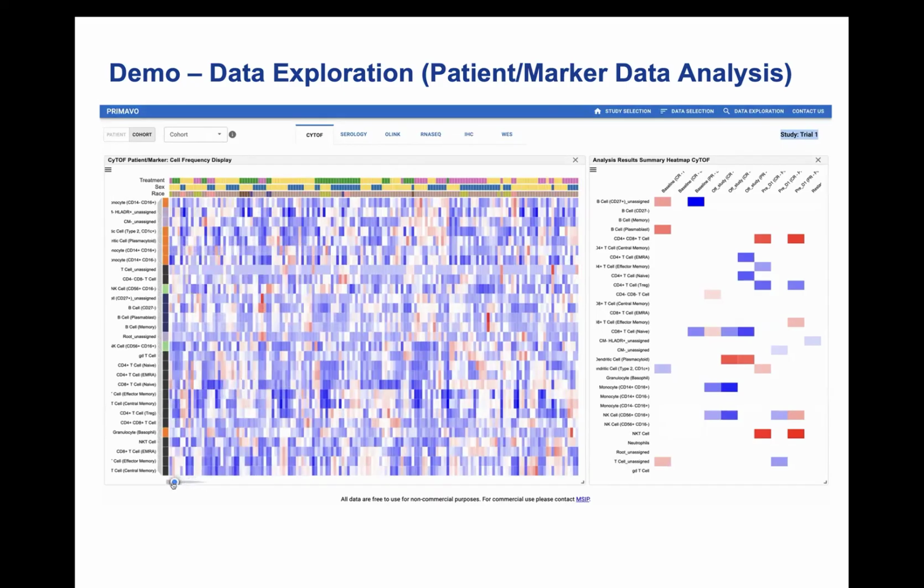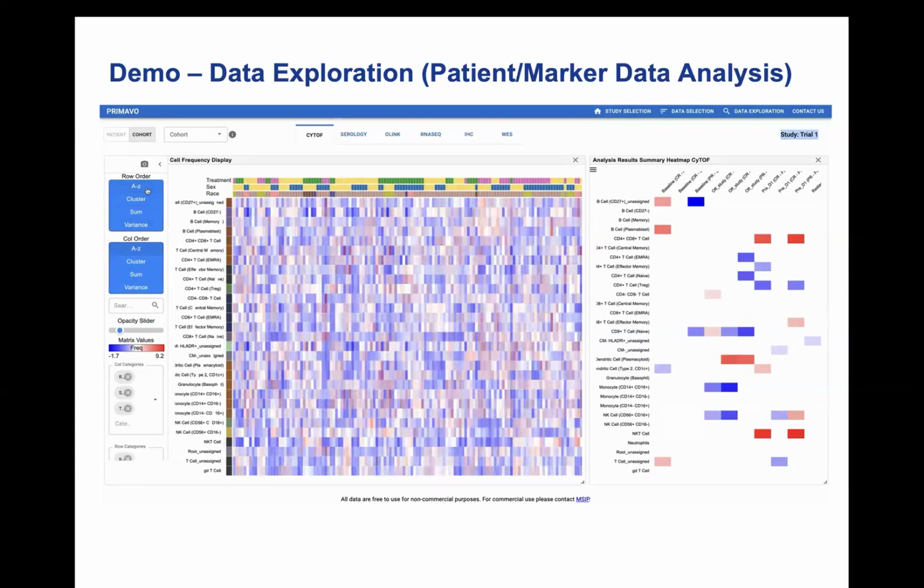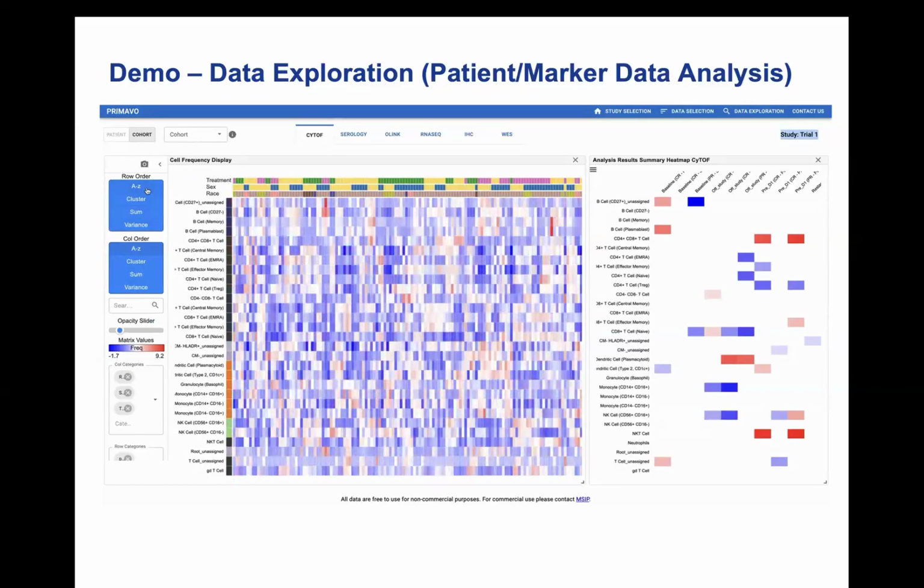We can see that we can make these clusters more finely grained or more coarsely grained, depending on what our interest is. And actually, there are different parent classes, and we can even put all of them together to look at all these cell types together. And we can order them, sort them with respect to cell type name.